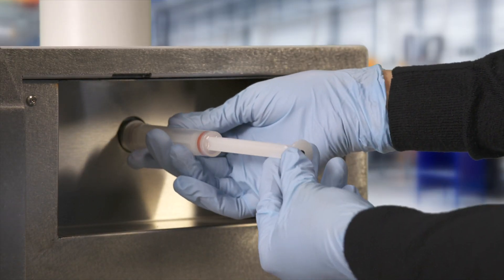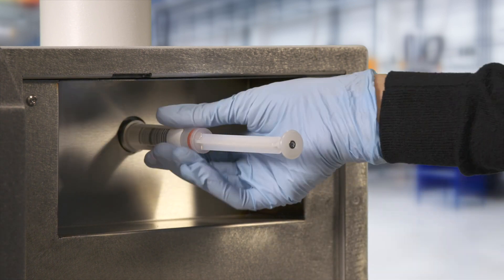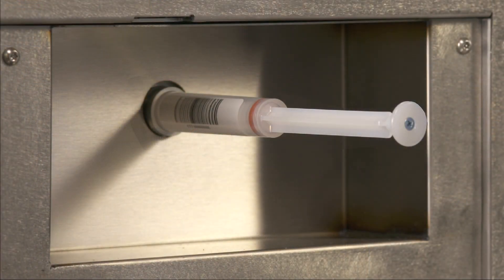Be sure to align the sample cartridge with the sample cartridge port, and screw the sample cartridge clockwise until it no longer turns. If the sample cartridge is installed correctly, the collection substrate will face up, with the barcode lined up with the barcode reader.